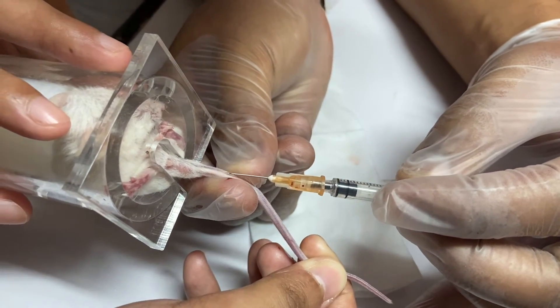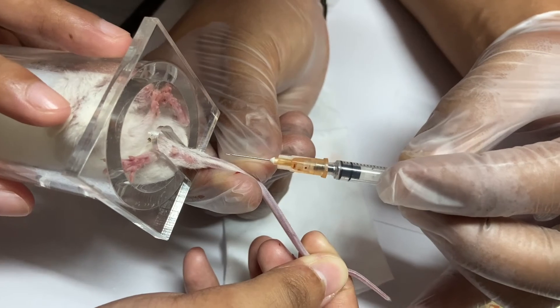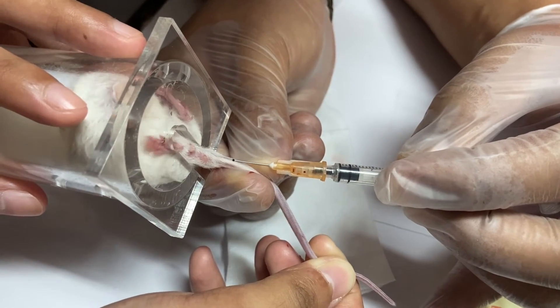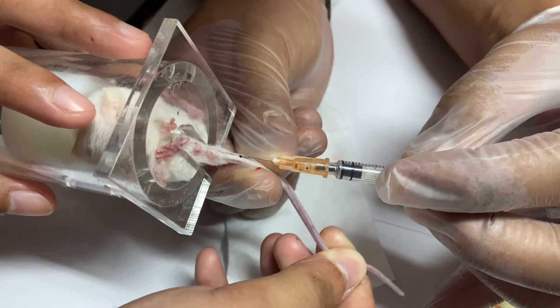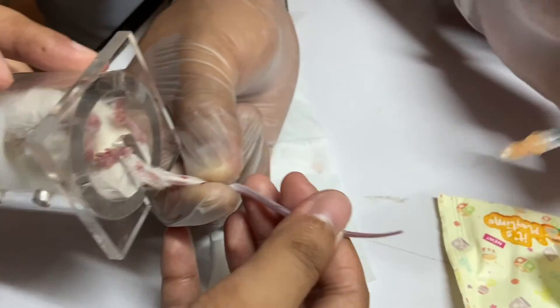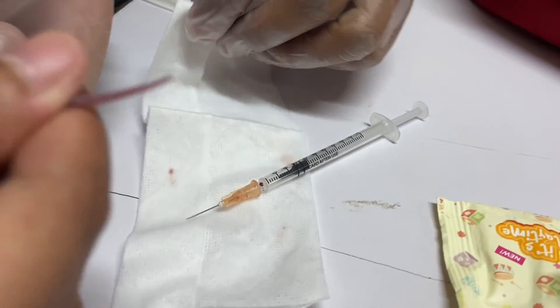Blood will be visible at the base of the needle if the needle is in the vein. Inject slowly. Note that the blue-colored vein becomes clear during injection. Withdraw the needle and apply pressure using sterile cotton with alcohol to stop bleeding.